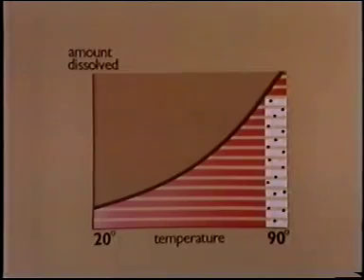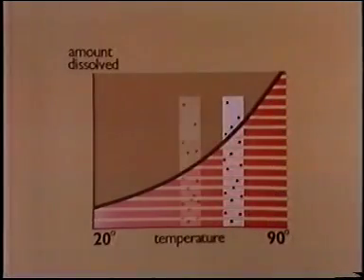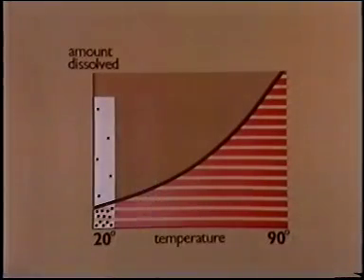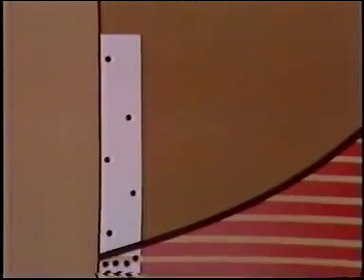We now cool down the solution. Some of the solid can no longer stay in solution at the lower temperature, and so crystallizes out. Most of this is the compound we want. When room temperature is reached again, some of the solid is left in solution, but most of it has crystallized out. The precipitated solid we filter off now contains much less of the impurity than the crude sample, and this contamination is removed in a second recrystallization.